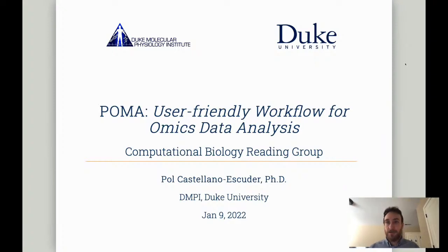Thanks for the introduction. My name is Pol. I'm a postdoctoral researcher at the Duke Molecular Physiology Institute, working in Hershey Lab with Akshay. Today I'd like to present this software called POMA, a user-friendly workflow using one Bioconductor package and one Shiny application for omics data analysis, basically.